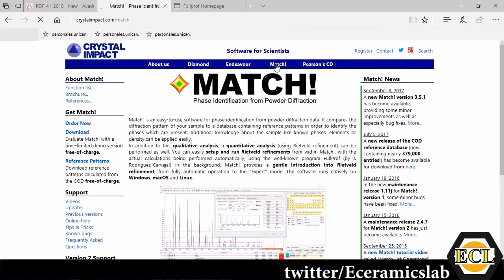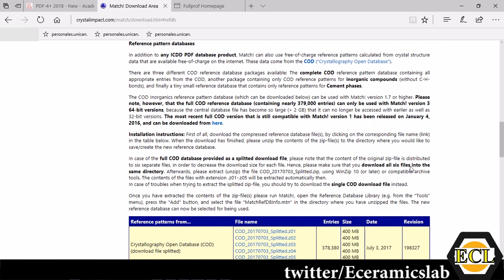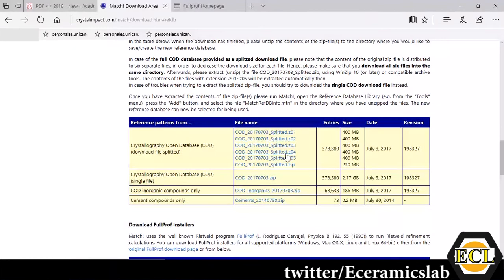After downloading you have to download a reference database. Here you can have a Crystal Open Database as well which is a freely available database which has around 378,000 entries in it.